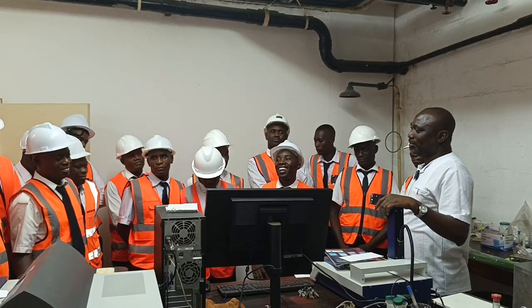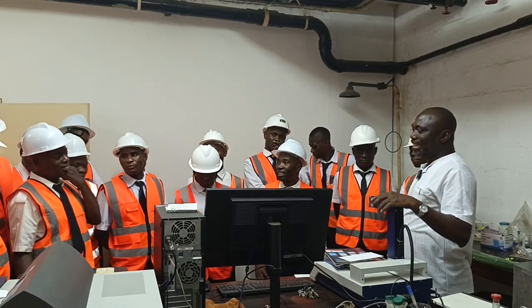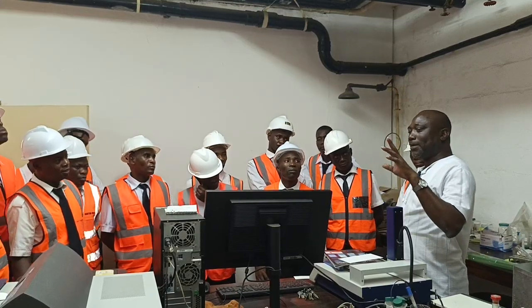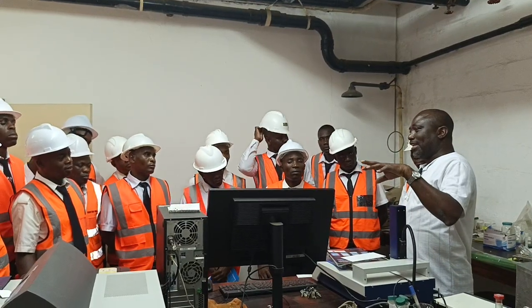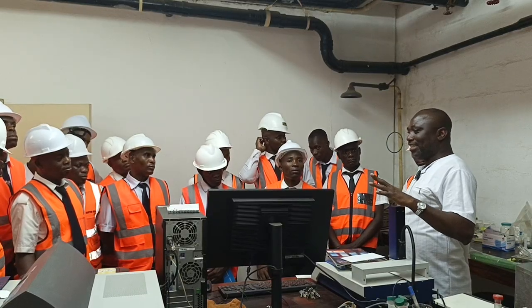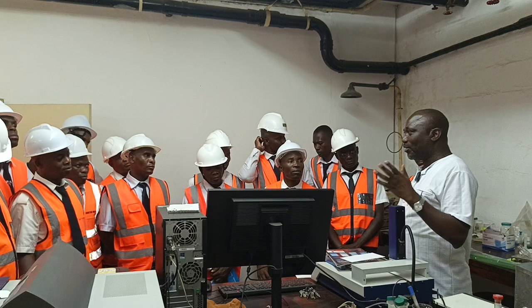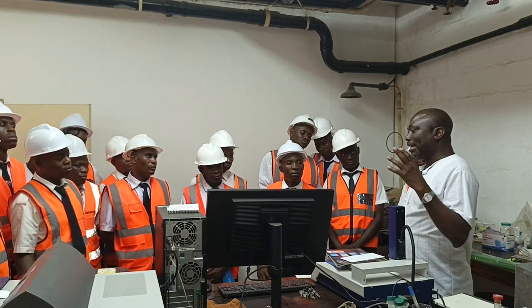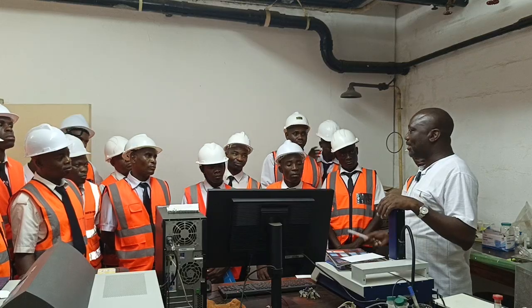Simply that's why. And how long does it take? For this machine, it's robust. It's fast. All things being equal, the analysis with this machine only takes less than 1 hour. What may take longer is the sample preparation.